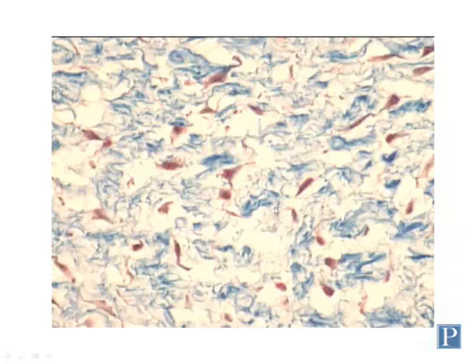Here's another section of mucoid connective tissue where it's a little bit higher density. So you'll have to look around on the slide. This particular type of connective tissue is only found in the umbilical cord. It's sometimes referred to as Wharton's jelly as well. There are blood vessels on the slide, and those tend to be the most eye-catching, prominent structures. So usually you can find the mucoid tissue surrounding the blood vessels, so look a bit outside of it.